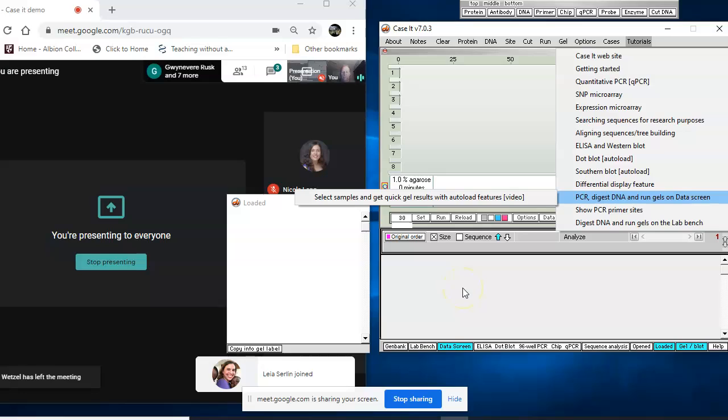A walkthrough is basically me doing this, but stopping and doing a screenshot and pasting it in as I go. That just shows you how to do the technique, and then the assignment is like, okay, now go redo it yourself and answer these questions. So there's an assignment on there called Case It One assignment or something like that.